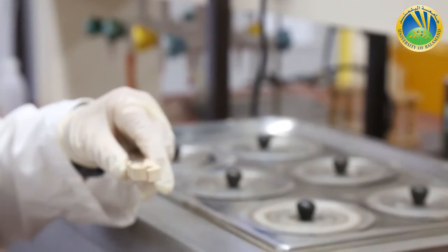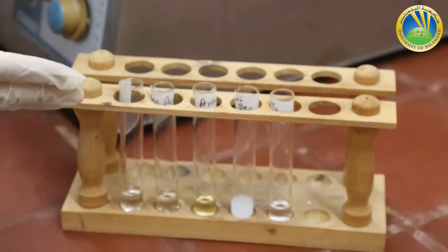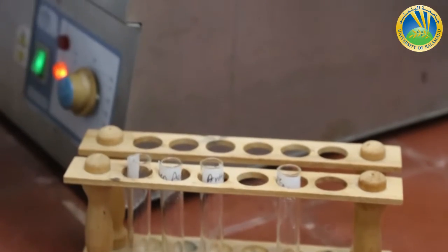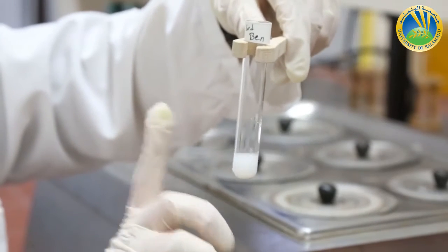So for those three compounds, there is no need to do the hot test because the solute is already soluble at cold.